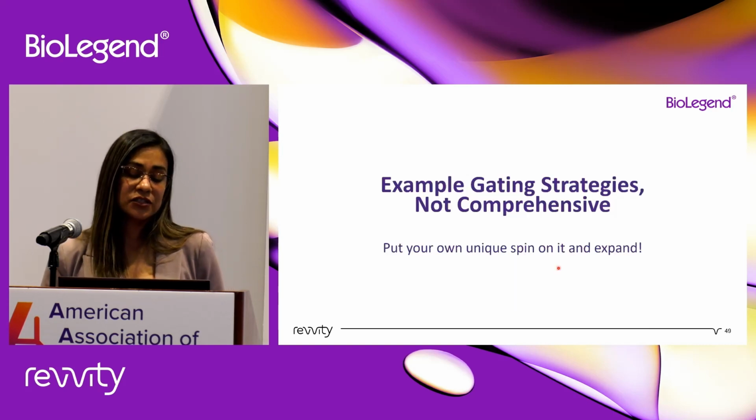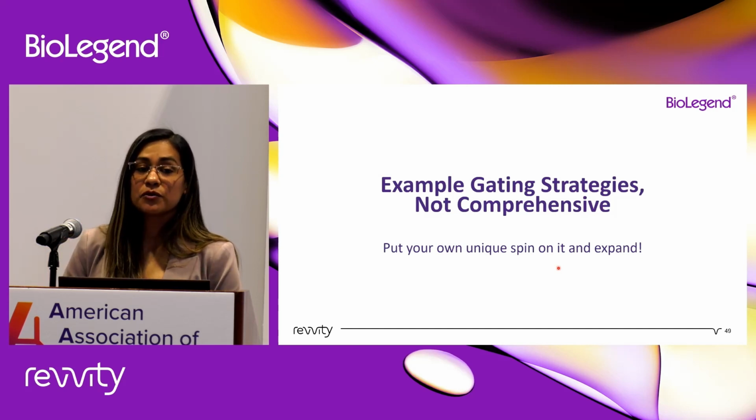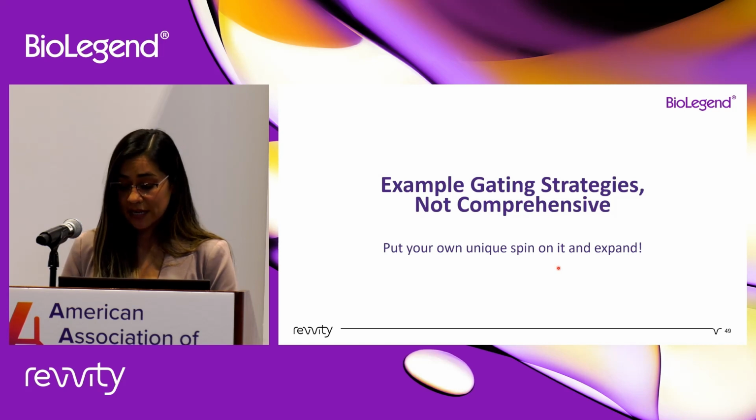And of course, this is just an example of the gating strategy, and you can put your unique spin and expand it as is best for your research.